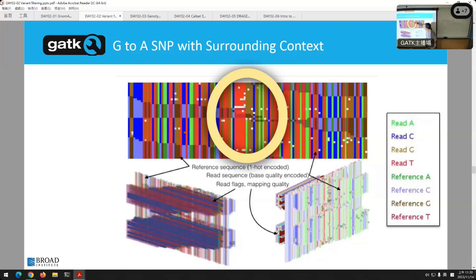So look over here, right in the middle. I don't know if you can see them online. Right at this position here, there's brown and A. And you see a SNP right here. It has learned from the data, from the features of it, that there is a SNP in this position in the genome based on the reads. Okay? And it can learn other things too.